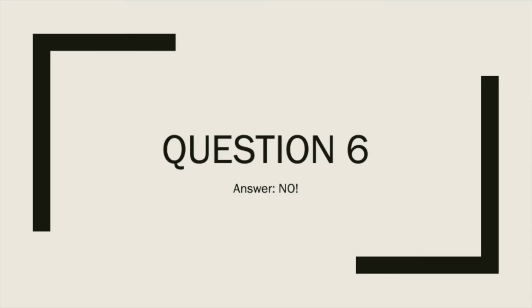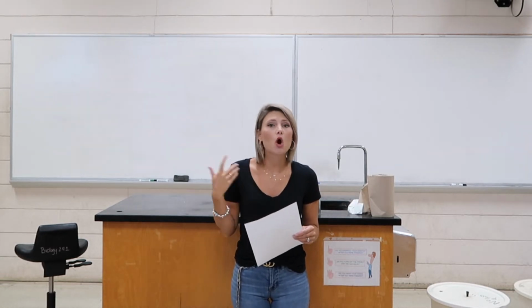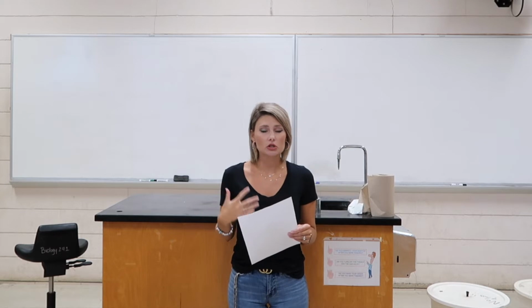Number 6, are you allowed to work unsupervised in the lab? Of course, no. The front door locks for a reason whenever it's shut, so there will never be a time where you are allowed into the lab by yourself. You're going to be dealing with fire a lot in here, chemicals, bacteria, so you always are going to need to be supervised in here. So the answer to that is no, you're not allowed in the lab by yourself.